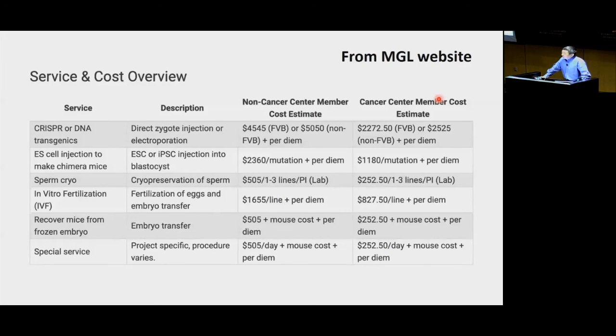But if the lab is willing to take the risk, say even if it's not working, you understand the risk, we can do it, because we have the technology, and you are willing to do this, why not? We can do it actually, because the procedure basically is the same, but you also need to understand the reagent.